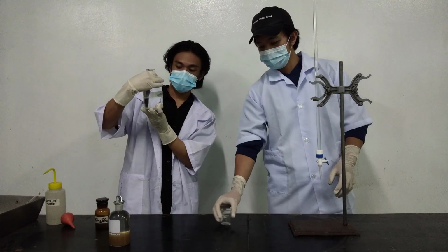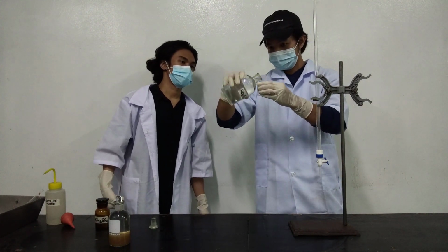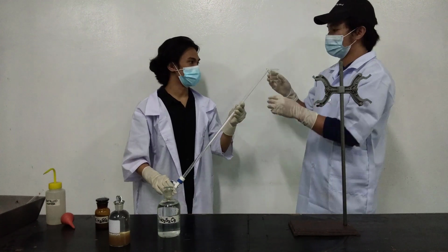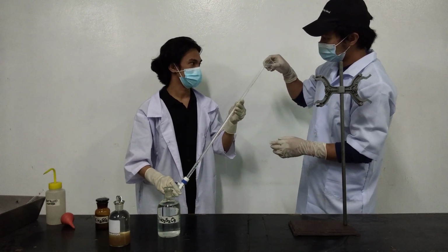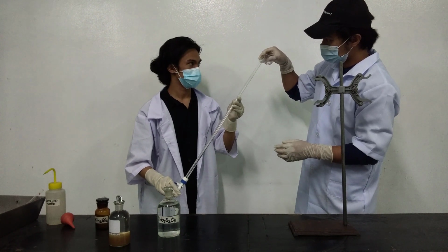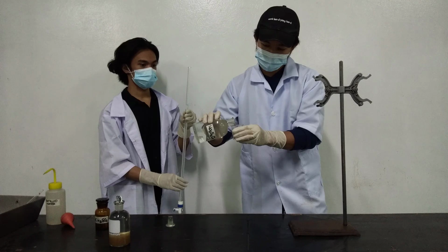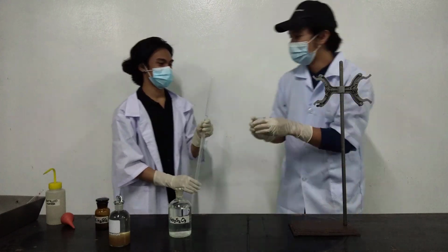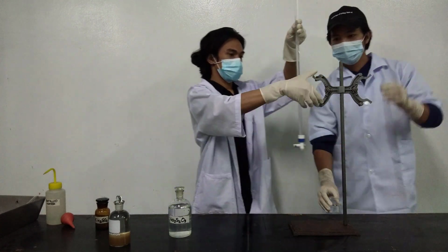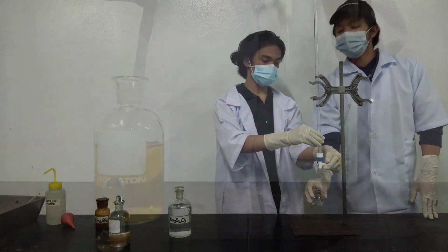Now for the titrating solution, we will need to place our sodium thiosulfate solution inside the burette, the 50 ml burette. After placing your sodium thiosulfate solution inside your burette, we will need to clamp the burette that is attached on the iron stand.